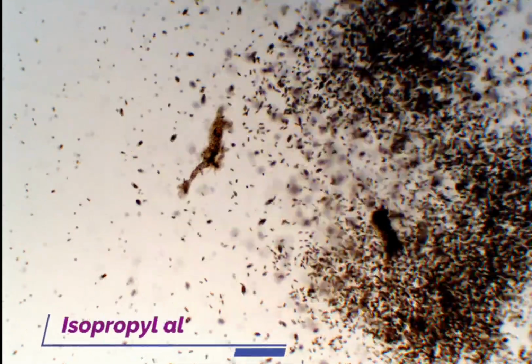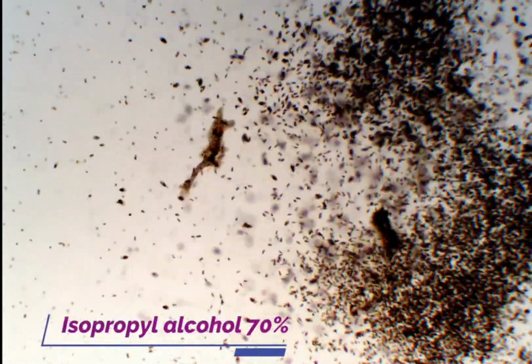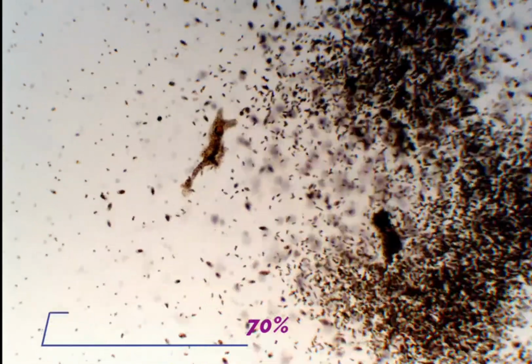So is there another massive colony? And we are going to introduce isopropyl alcohol to this. And see how fast it reacts with these viruses and bacteria.